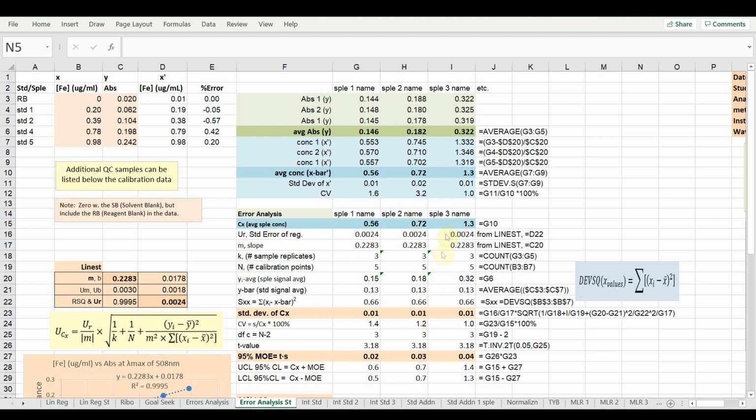Now in regard to outliers, if you check this highest first point, 0.188 absorbance, both Grubb's test and the Q-test tell us that this data point should be included. It should not be disregarded. If the sample replicate absorbances are simply replicates from the same solution, then they're just the measure of the stability of the instrument, and they don't fairly include all of the variation in the method.